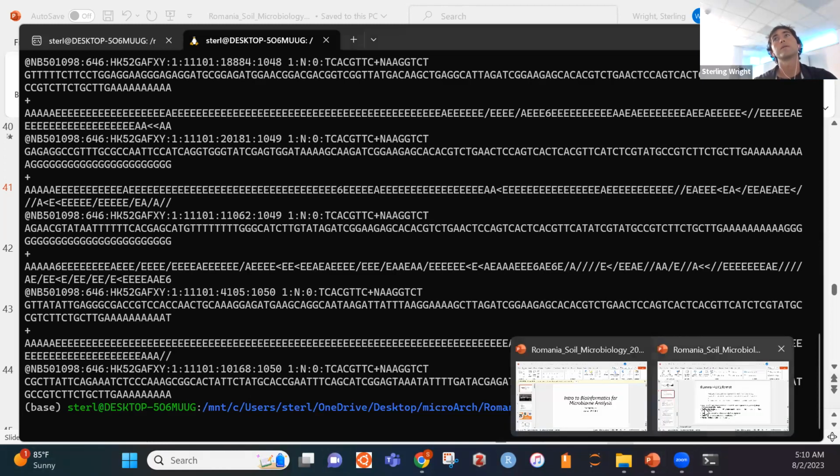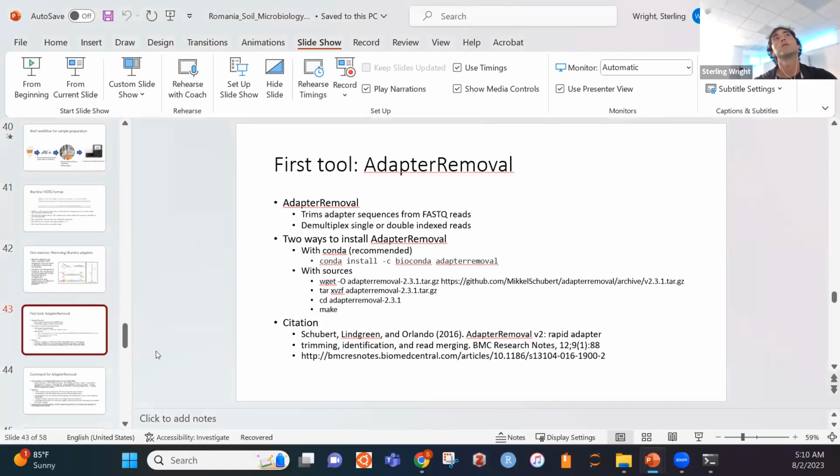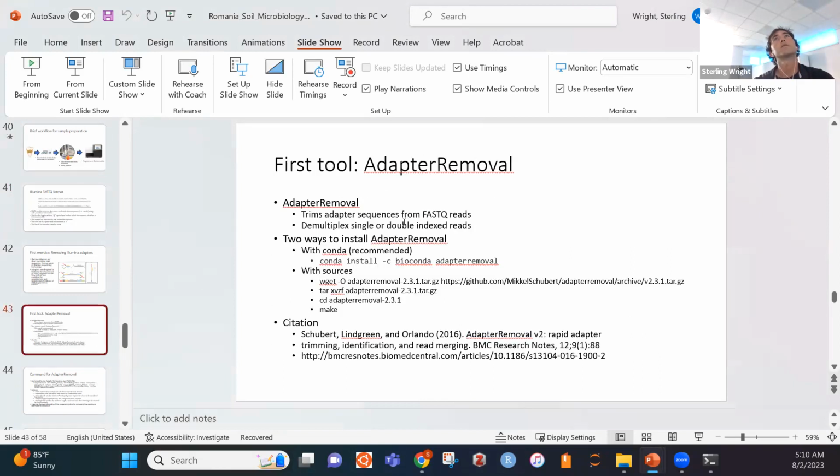So if I bring up my slides. I'm going to be running this command here. Oh wait, before I get ahead of myself, I need to copy and paste the other commands into the terminal, just so people can keep them as a record.